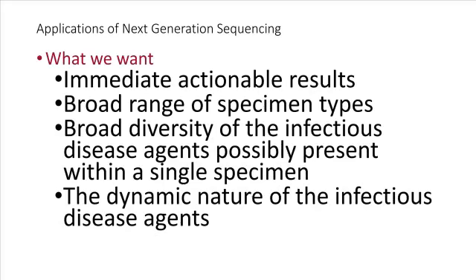So what do we want? We want immediate actionable results. Sample in, we want to know what's there tomorrow, and we want to know if it's important. A broad range of specimen types: we want to send in oral fluids, tissues, serum, whatever may come to mind, and have all these answers available.